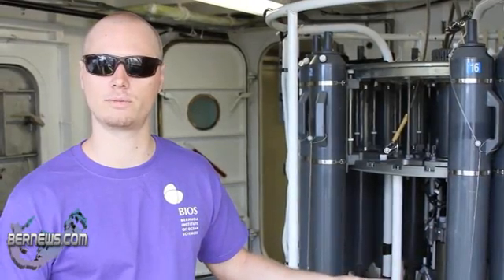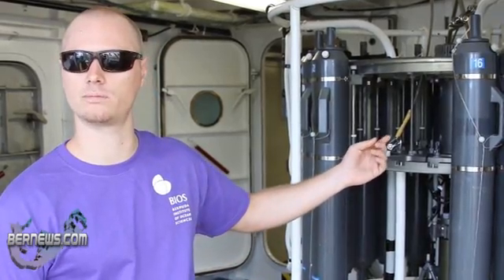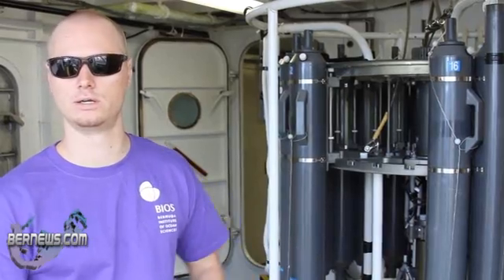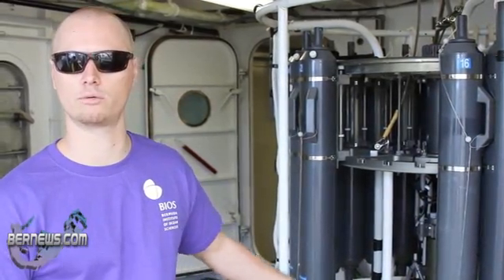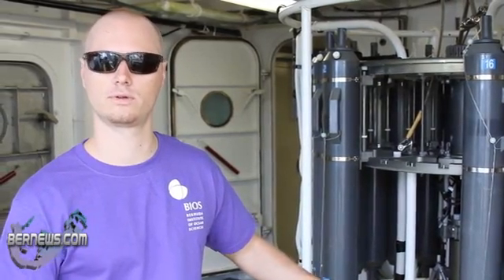For instance, a scientist might say he wants to collect water at 500 meters. So we'll stop the instrument at 500 meters, and we'll fire the bottle — a trigger mechanism that snaps the bottle shut — trapping the water at that depth. We can do that for 24 different bottles, so we can sample 24 different depths maximum, or fire all the bottles at the same depth.